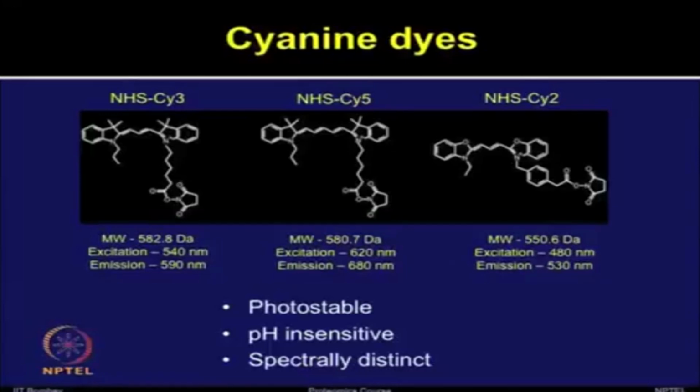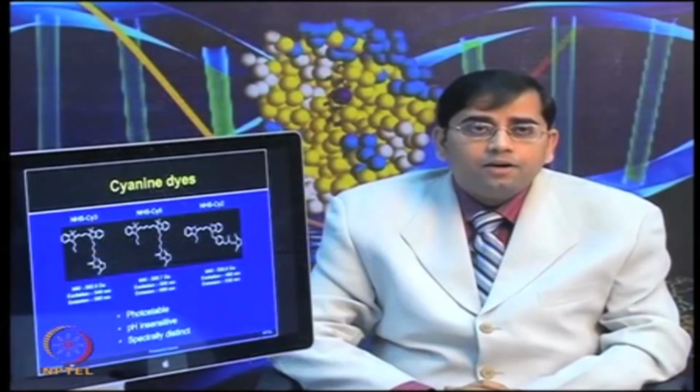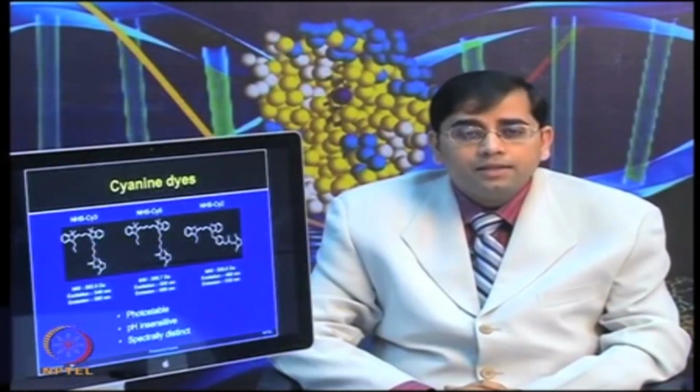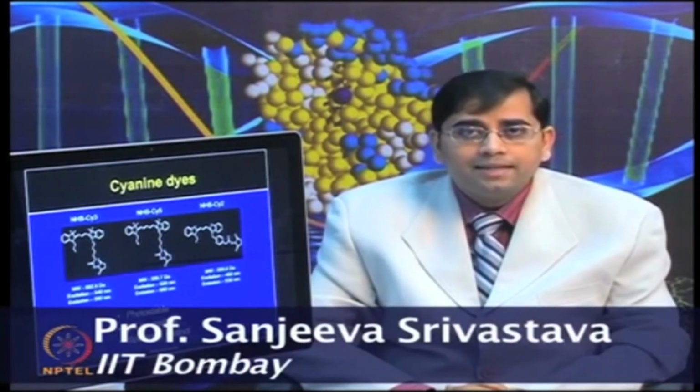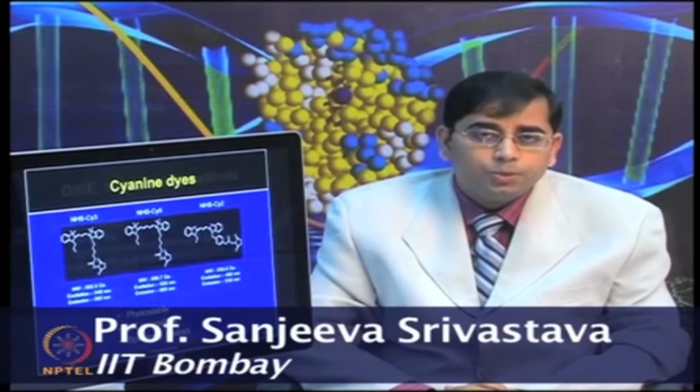The Cy3 excitation wavelength is at 540 nanometers, emission wavelength at 590 nanometers. The Cy5 excitation at 620 nanometers and emission at 680 nanometers. The Cy2 excitation at 480 nanometers and emission at 530 nanometers. So, these dyes are photostable, they are pH insensitive and spectrally distinct. By using these dyes, the DIGE method can be used.